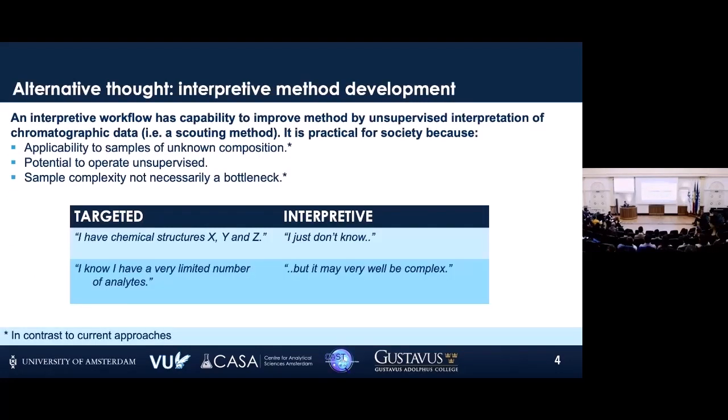So, also in terms of optimization programs, let's get to business, right? I have a sample, and then the question is, okay, develop me a method. And then of course, there are great minds that will take the sample and start to do trial and error based method optimization, maybe even use literature and experience to do it a little bit faster. But generally you work from the sample that you have, and this is of course good, but it also takes a lot of valuable time.